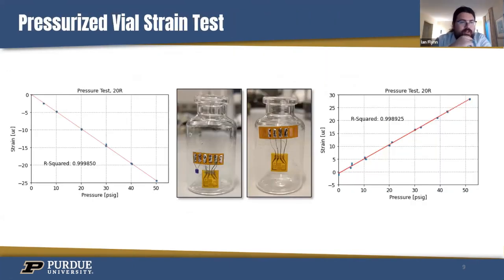Is sucrose recommended? I'm not exactly sure. We hope to do sucrose and BSA formulations later on. We have focused on using sucrose and trehalose, and especially sucrose, just because it's been the most well-behaved and the simplest profile to analyze.